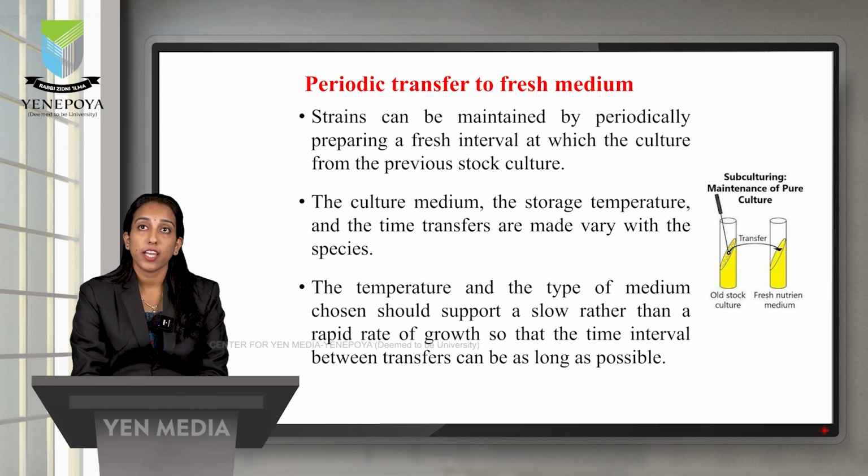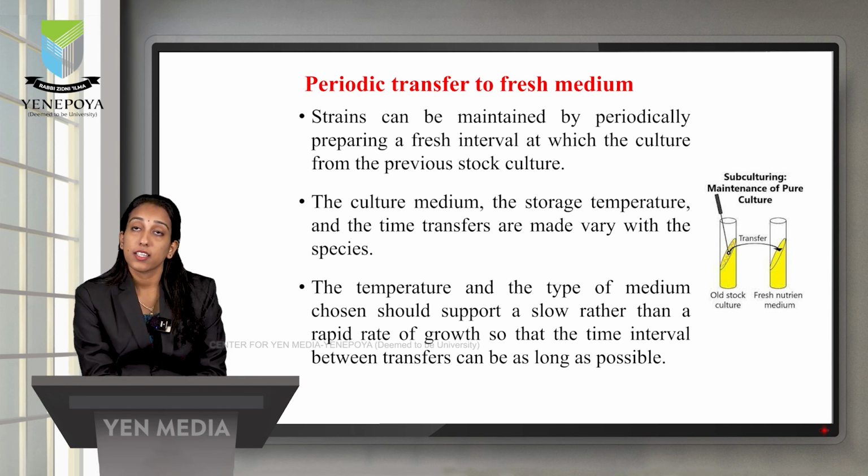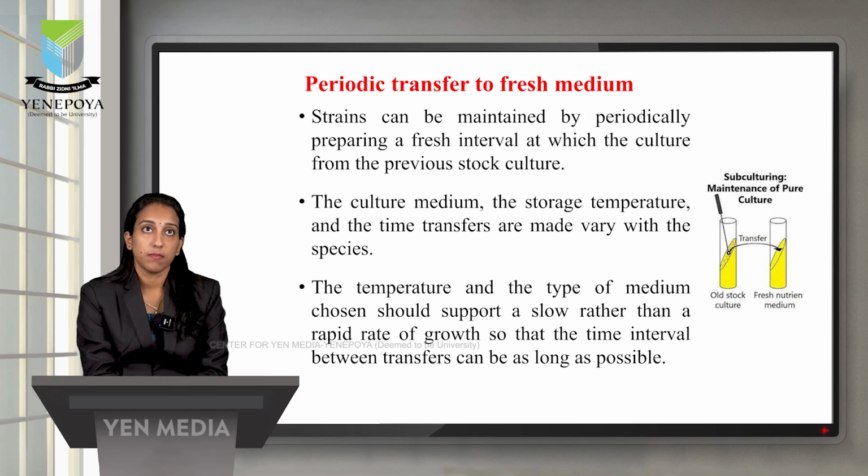From that, we were taking the microorganism and transferring it to the fresh nutrient medium. It is a subculturing process. Here it is happening as a subculturing process.